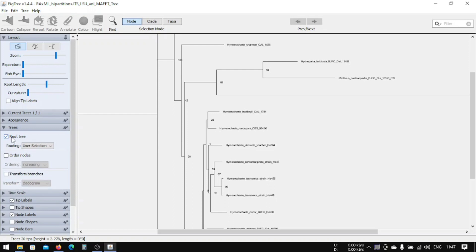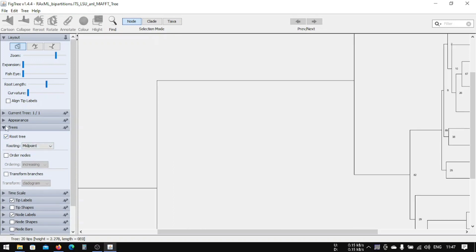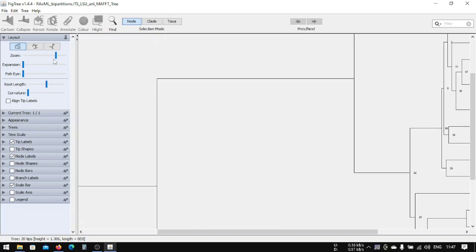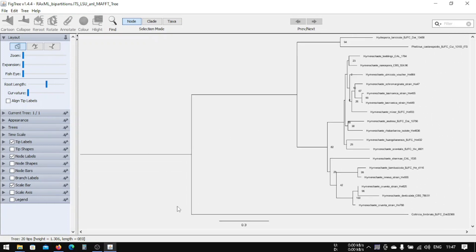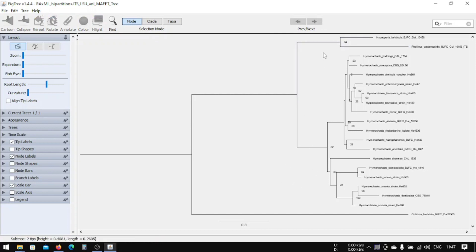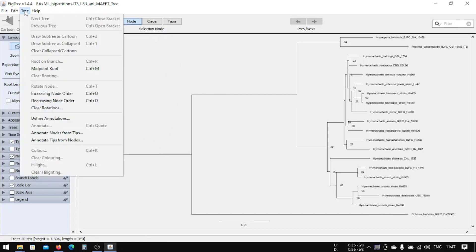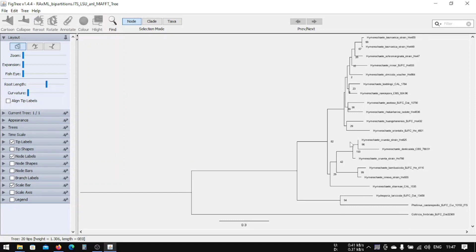If you root the tree, you can select midpoint rooting. Zoom out and you can see the tree here. These are our outgroups — you can select them accordingly.